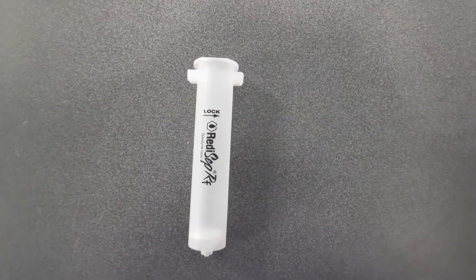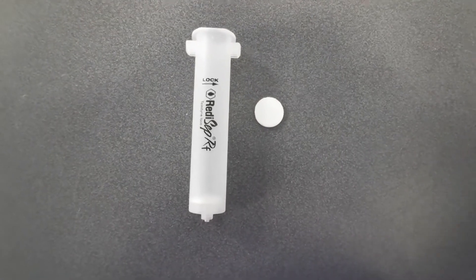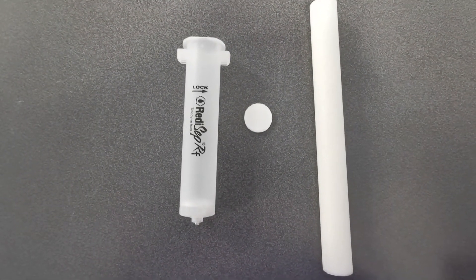In order to use dry loading on the Combi Flash we need an empty dry loading cartridge, we need a frit, a plunger to pack the cartridge, and finally your sample.